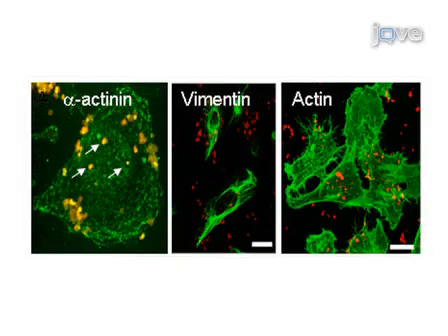In contrast to α-actinin, experiments in which labelling of internalized bacteria and either vimentin or actin was performed reveal occasional co-localization with actin, but rare co-localization with vimentin in HbMEC cells. As observed in the previous experiment, α-actinin was concentrated around several internalized bacteria, indicated by the white arrows.